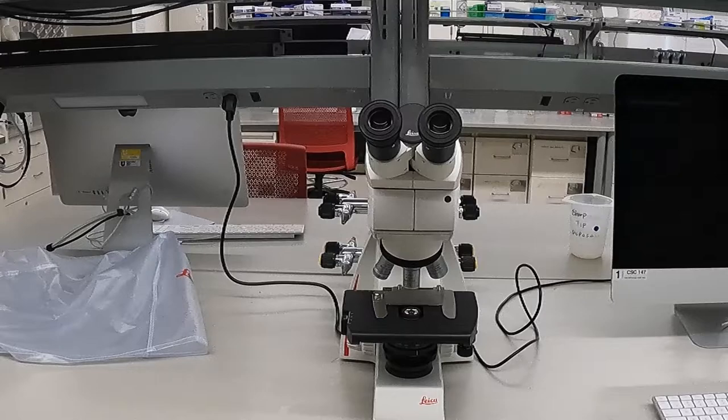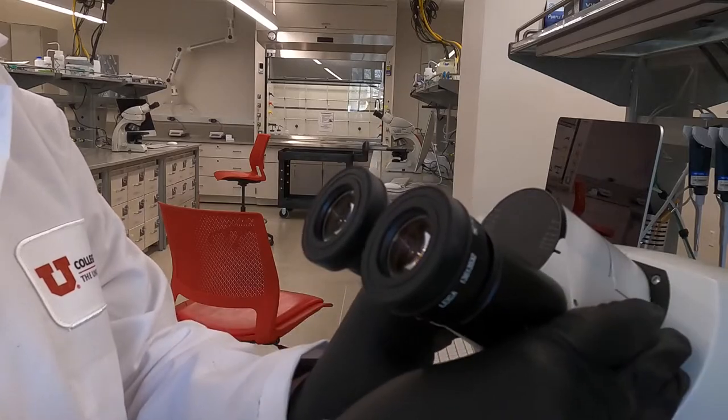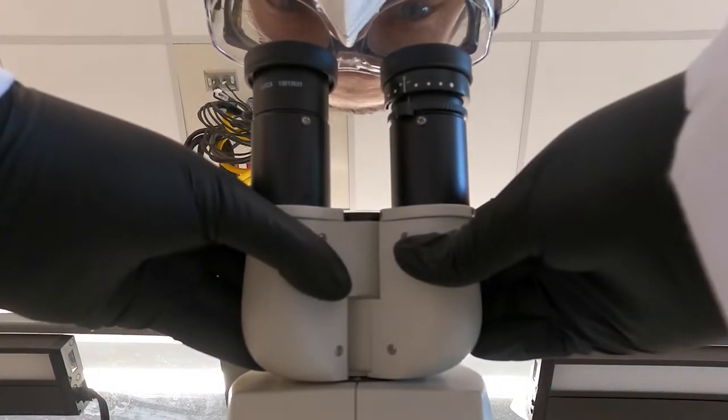The first component we'll cover is the eyepiece, which can also be referred to as the ocular lens. This has a 10 times magnification and can be adjusted for comfort as shown here.